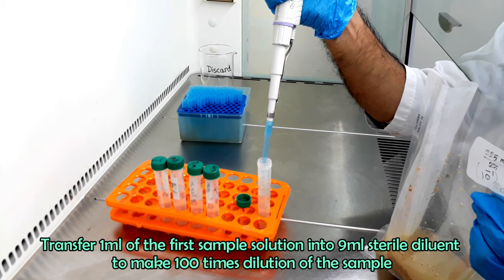Now we have to decide which plate counts should be considered. Plates with 25 to 250 CFU should be considered for the calculation. We have found uncountable number of bacteria in 10 inverse 1, 10 inverse 2, 10 inverse 3 and 10 inverse 4 dilution plates. We have found 762 colonies in trial 1 and 734 colonies in trial 2 plate of 10 inverse 5 dilution, which are not acceptable count, because the counts are much greater than 250 per plate.